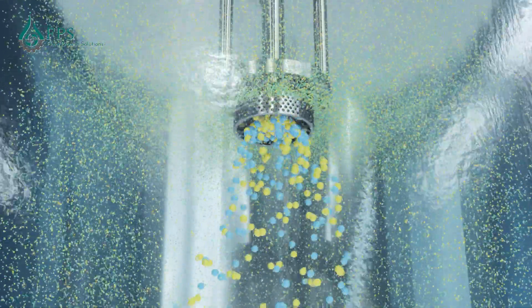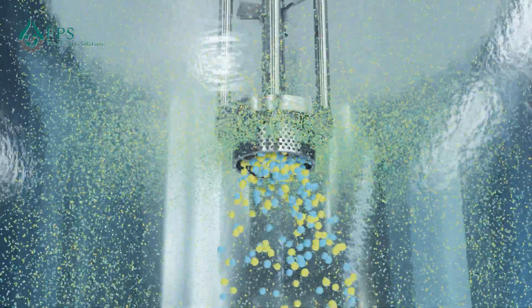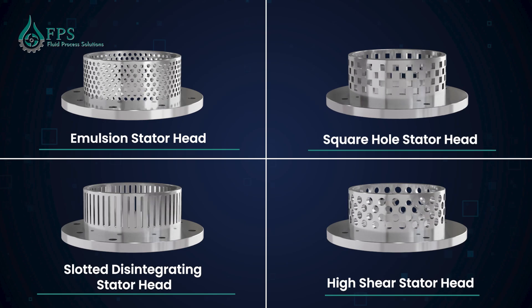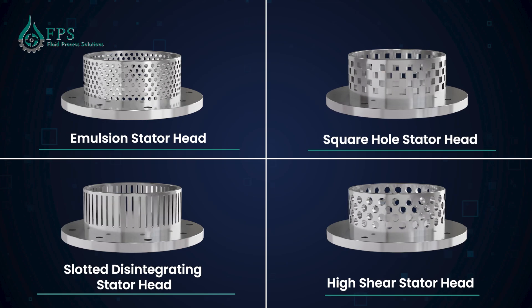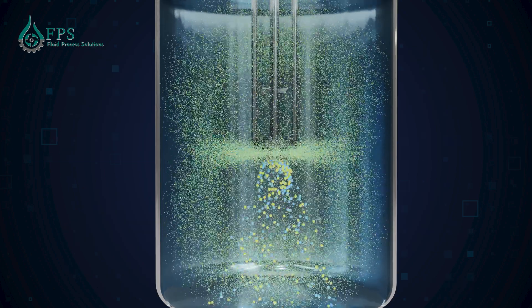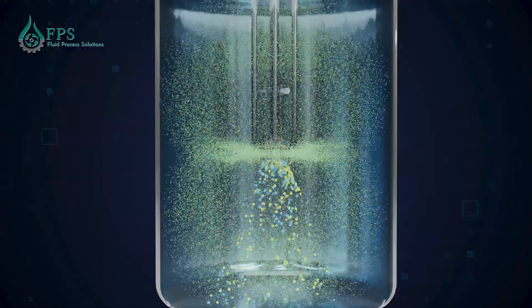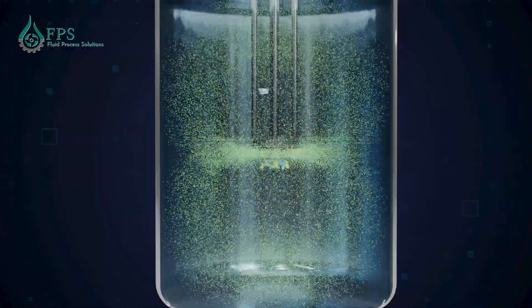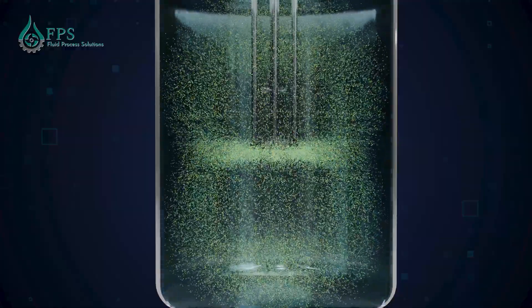The stator has different perforations selected based on the working application of the homogenizer. The sheared material is projected outward to the mixing vessel while fresh material is continuously drawn in, resulting in a continuous mixing pattern.